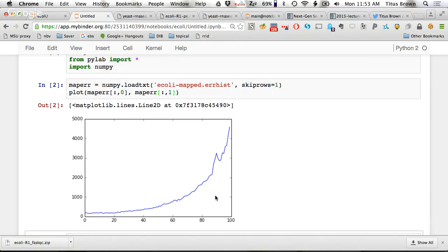This actually is a pretty good excuse for now trimming sequences, right? At this point, I could say, look, well, is that true? I mean, we're only getting a 5% error rate at the very end, right? That's 1 in 20 sequences are erroneous at this position. It'd be pretty interesting. Let me do a quick look.